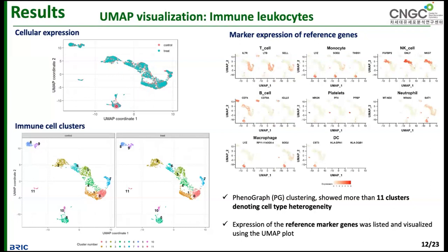After that, we need to perform cellular annotation to make sure how many clusters there are, how many different clusters, heterogeneous. For that, we performed cellular annotation in R to get 11 different clusters. Here it looks similar. When we perform the cellular annotation, we can get all the different clusters, and we can consider each cluster as one different cell type. Then we perform the marker expression analysis one by one to make sure this belongs to the T cell and this belongs to the B cell, so we can clearly identify the cellular phenotype. So we can confirm all the B cell types.